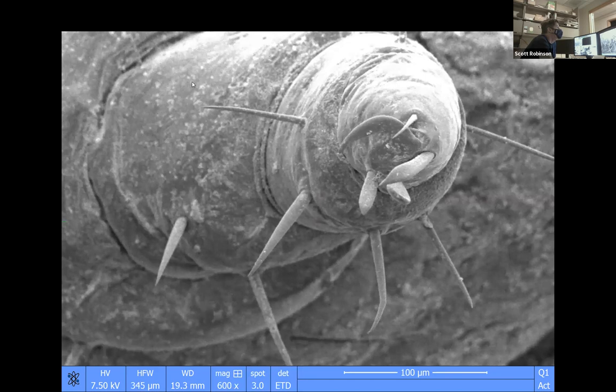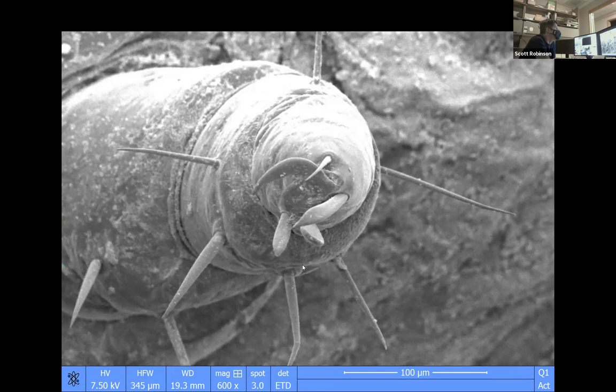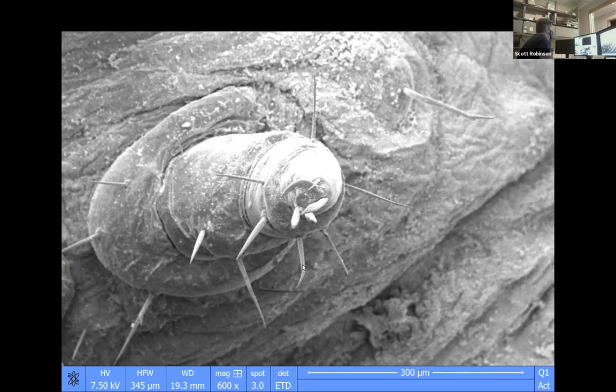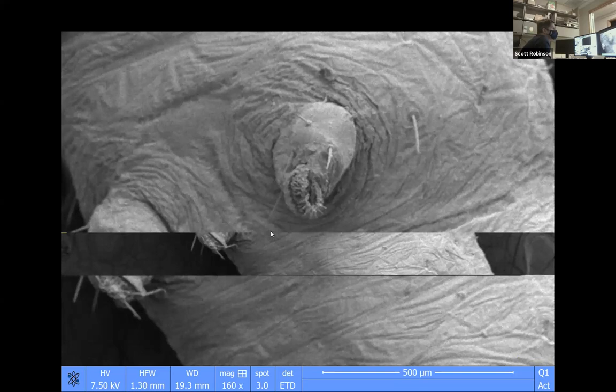Yeah. So this is the tip of one of the legs. It has little biting, cutting parts on it, or grabbing parts, and then it has little sensory hairs so it can figure out where its feet go. So if we go down and we look at the other legs on the bottom part of the body, they look a little bit different. More creepy.